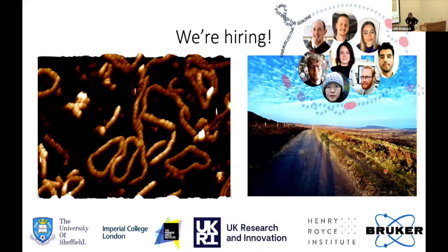Second question, really. I couldn't work out what the number was. In each of your pictures you had a number up the top. It couldn't have been linking number because it wasn't an integer. Linking number, and actually it's a nasty secret of some of that, and we've since rechecked it in singles. So we added specific amounts of ethidium and purified it out rather than gel eluting to get that resolution, because even electroeluting, we can have some issues with the AFM because it's picky. So some of them are mixed topoisomers because it's 339, so it doesn't really want to be in one or the other. So we have some mixed populations, and I can show you how they match to a gel if you want. Thanks.